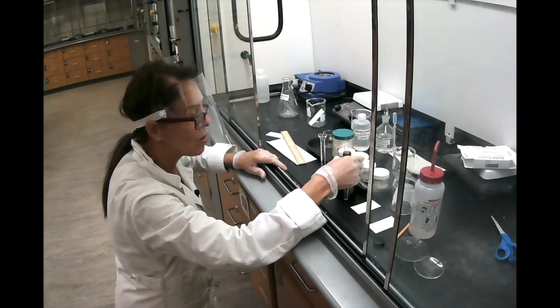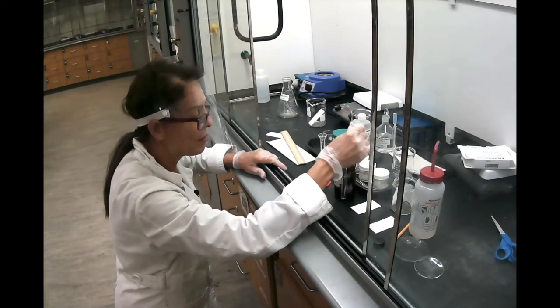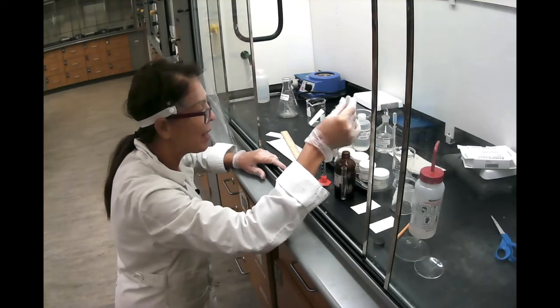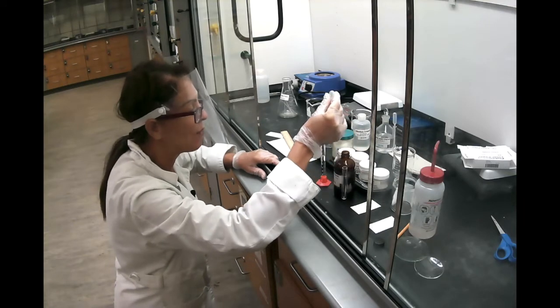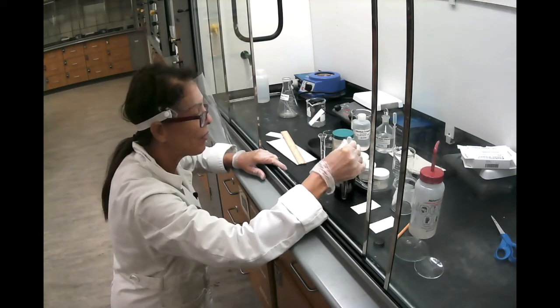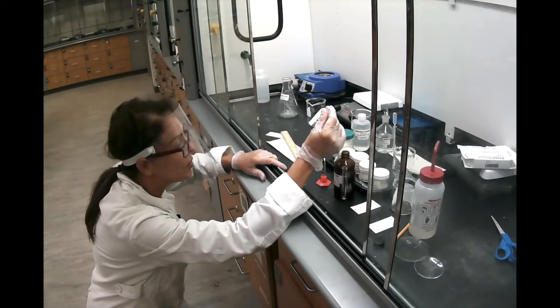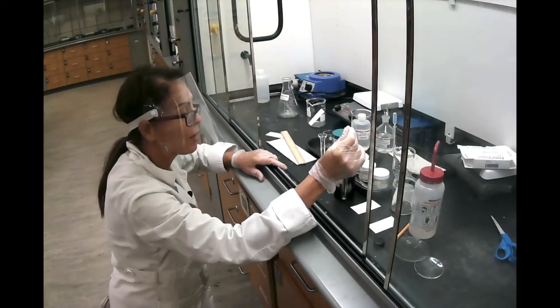It's better to go slowly and do it right than go fast and have to redo it again. So one pipette at a time, and when you get close to that 9.5, you go one drop at a time. Okay, I'm getting very close here, so I'm going to add one drop at a time until I reach 9.5, and that's 9.5.